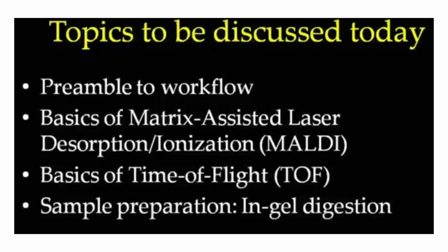Then in this lecture, sir also talked a bit about how exactly the samples are prepared, like in-gel digestion. We already talked about this in the last lecture too, when one of the individuals asked how exactly mass spec works.